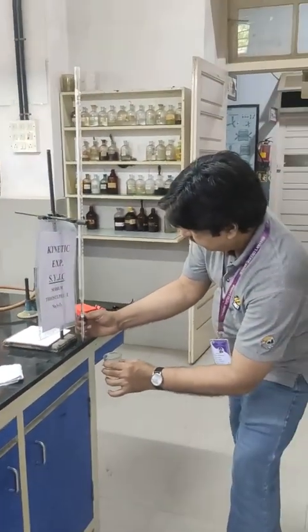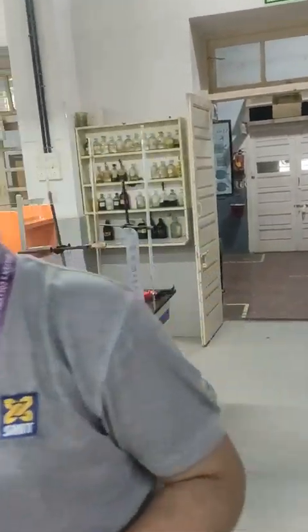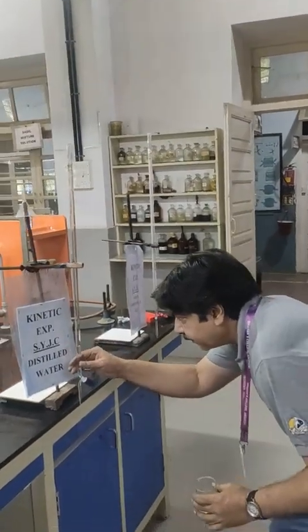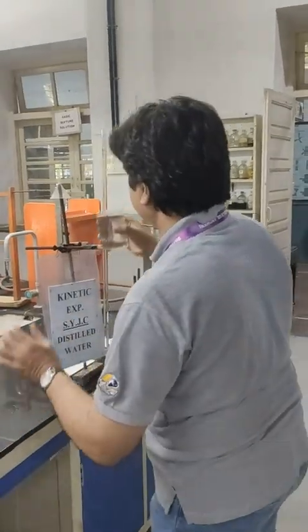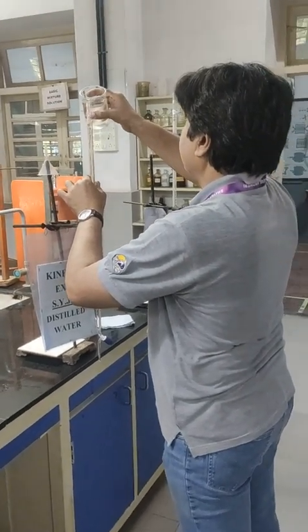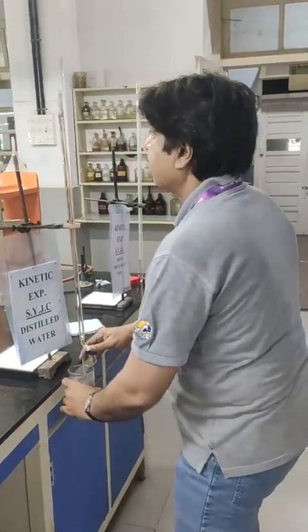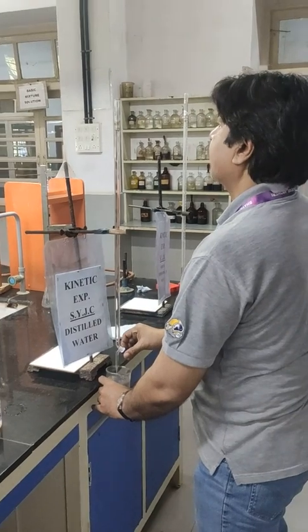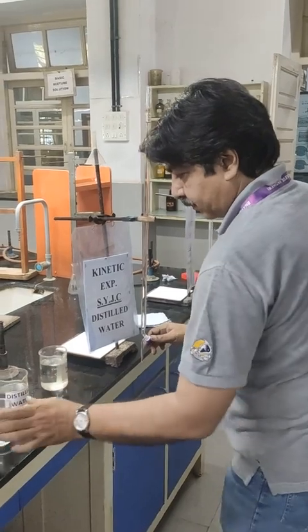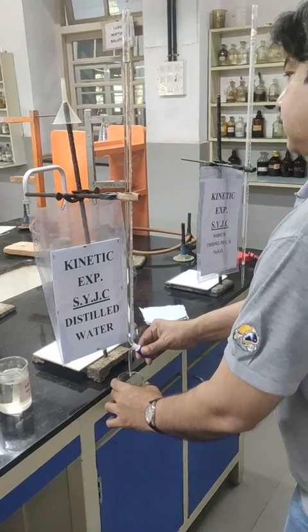Now to this I will be adding 8 ml of water. Adding 8 ml of distilled water.